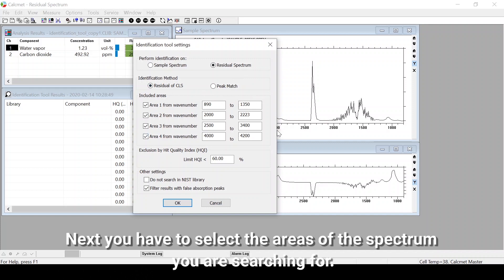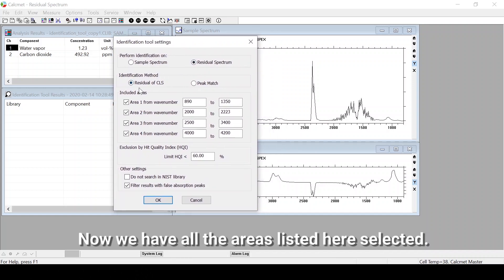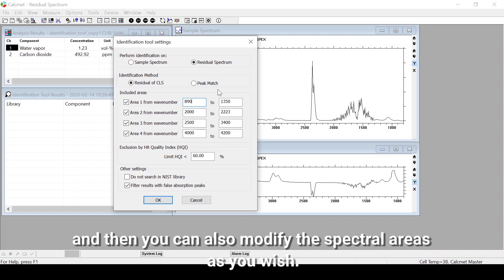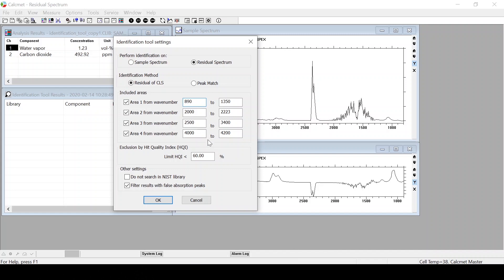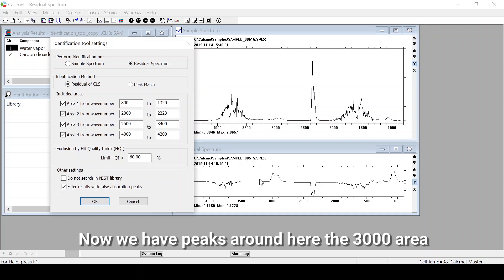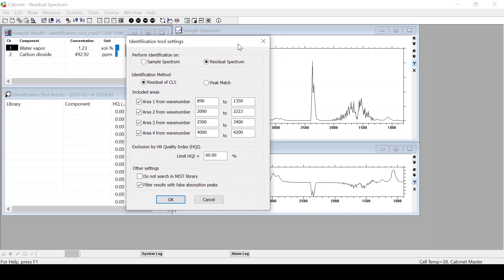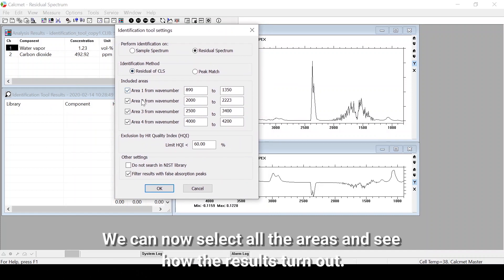Next you have to select the areas of the spectrum you are searching in. All areas are listed and selected here. You can deselect an area by clicking it, select it again by clicking it again, and also modify the spectral areas as you wish. Currently we have peaks around the 3000 area and around 1000. We can select all the areas and see how the results turn out.